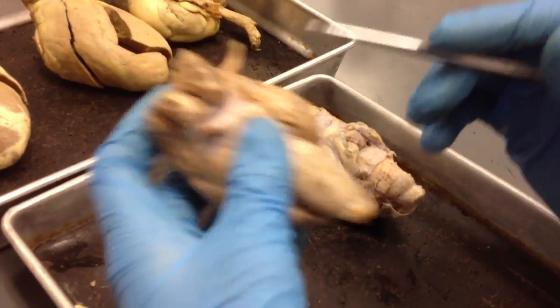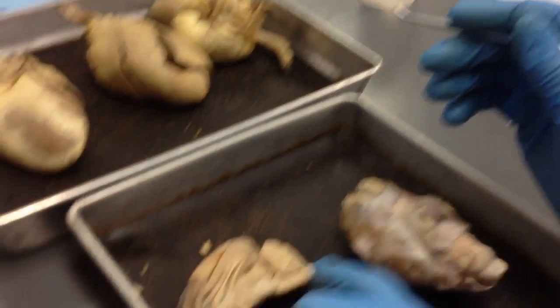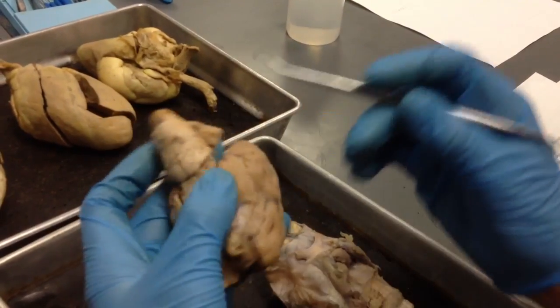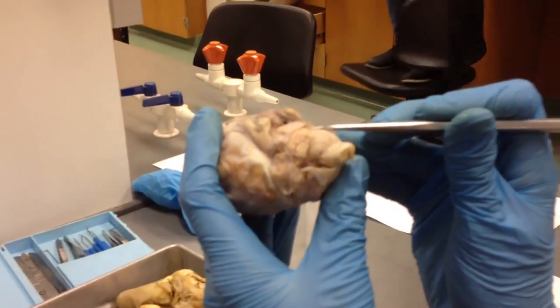Cranial nerve number 5 is going to be a little bit harder to see, but you can see where it's been ripped off on most of them. Right here, just above the trochlear. So number 5, the trigeminal, is missing in most of them, but visible if you lift the dura mater.